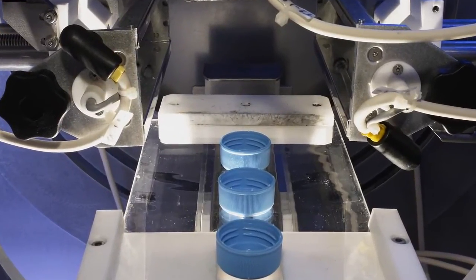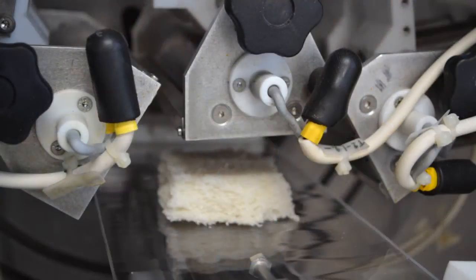Pulsed light treatment has potential for the decontamination of food surfaces, packaging and food contact surfaces.